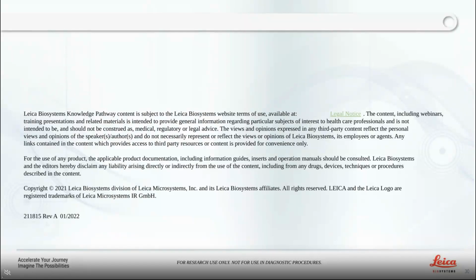Great. All right. Now, can you suggest protocols for antigenicity? I would suggest finding a cryosectioning paper for your field of study and using the methods section to locate the right protocol. There are plenty of cryosectioning papers in different fields. You will probably find a scientific paper that can help you or point you to the right lab to have a conversation with. Or you can also contact your local application specialist for troubleshooting.